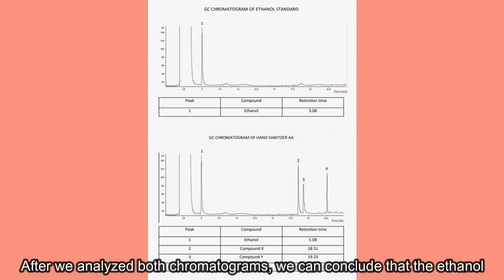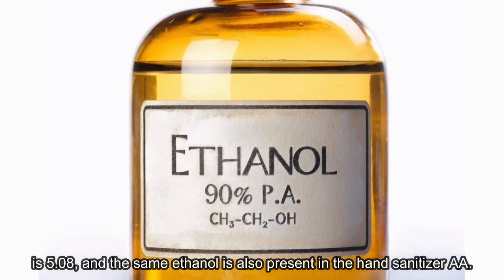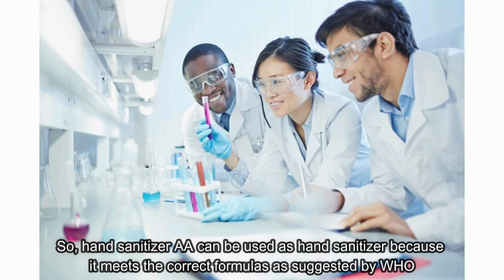After we analyze both chromatograms, we can conclude that the ethanol retention time based on the ethanol standard chromatogram is 5.08, and the same ethanol is also present in the hand sanitizer AA. So, hand sanitizer AA can be used as hand sanitizer because it meets the correct formulas as suggested by WHO.